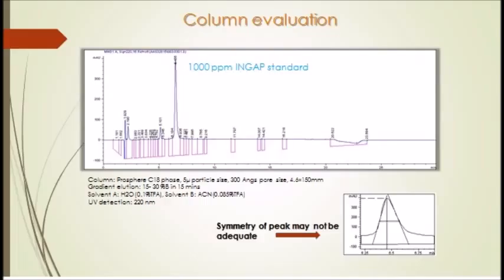An indicator of a utilizable column are the peak width and symmetry of a sample of standard. It is ideal to have a minimal peak width so as not to overlap peaks that may come before or after, such overlap decreasing resolution. Peak symmetry is also another indicator, as a lesser downward or forward slope of a peak may interfere with the resolution between a peak and its neighbors.